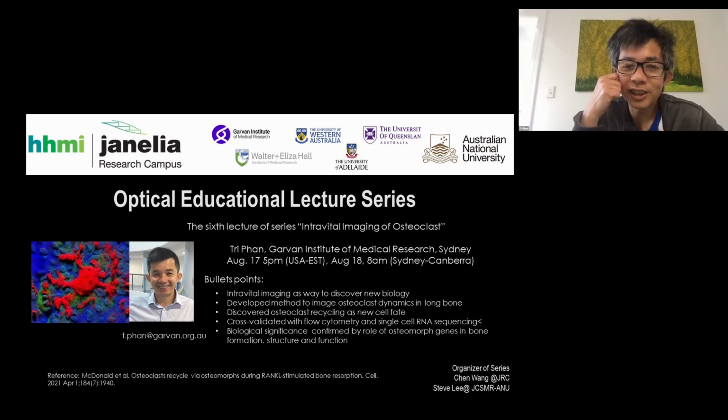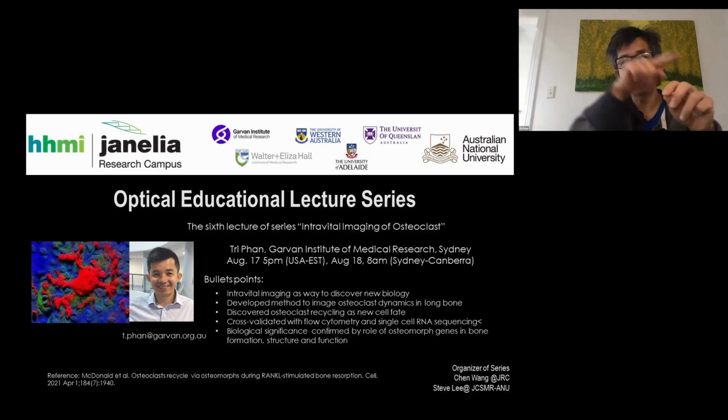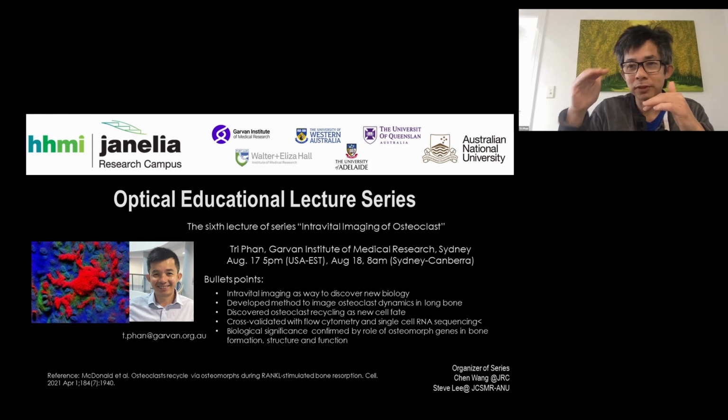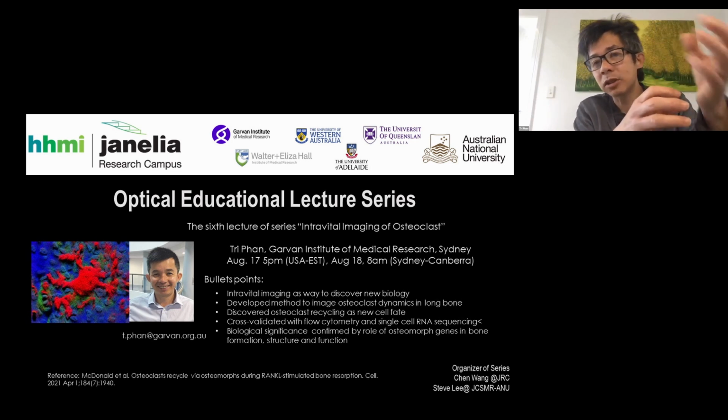Yeah, look, that's a really interesting question, and one that I just don't think we have the right resolution and the right method to track at the moment, because I do think that probably these cells are in a state of flux, and I think what we've captured, at least in terms of the transcriptional state of the cells that were in the marrow, may be a slightly more stable version to what we're seeing in the movies, where the cells are fissioned, and I think they're still active, and they might just fuse again.